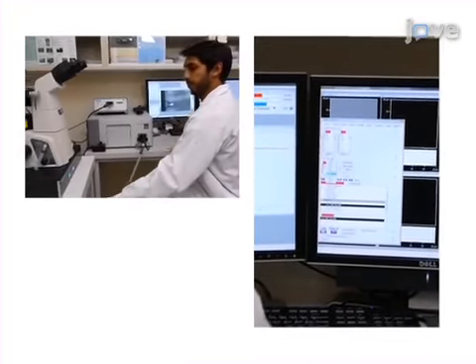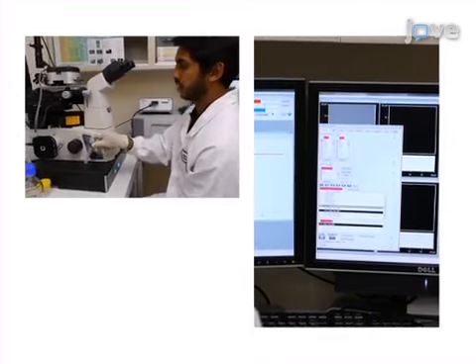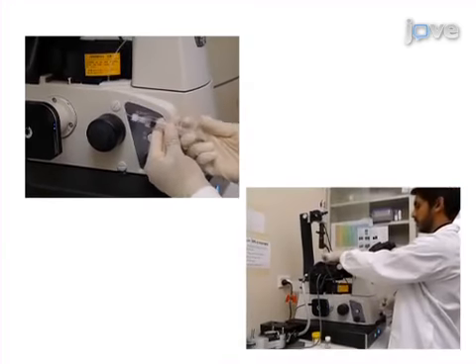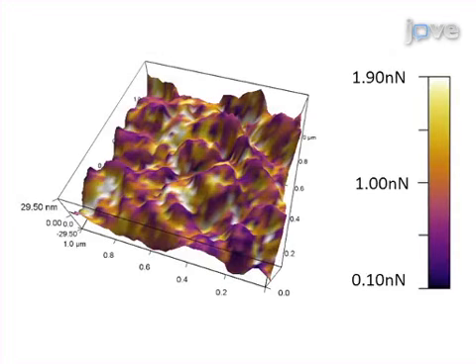For calibration, a direct measurement of probe sensitivity using a mica substrate in liquid is also made. Ultimately, colloidal probe microscopy can be used to measure the interparticle forces that may be responsible for coagulation kinetics and physical instability of the studied liquid colloidal system.